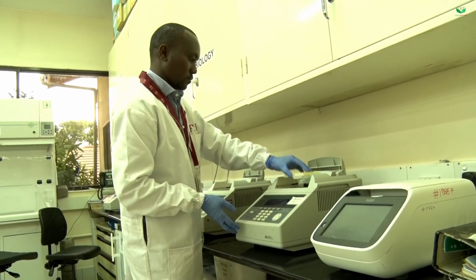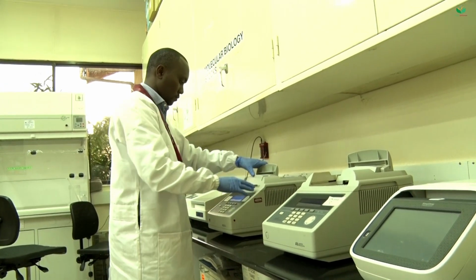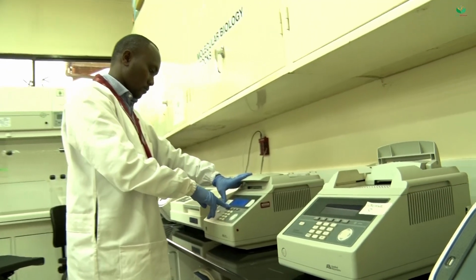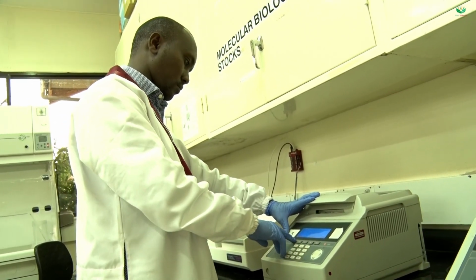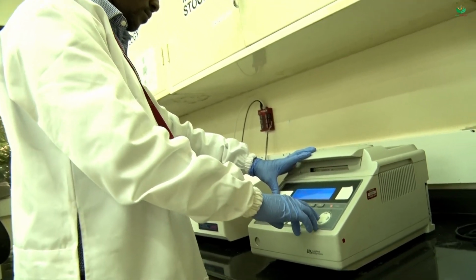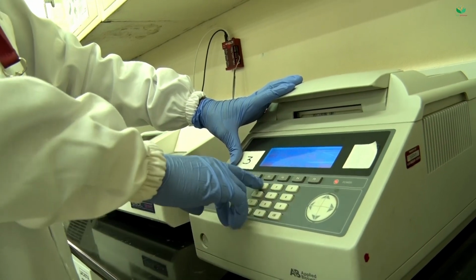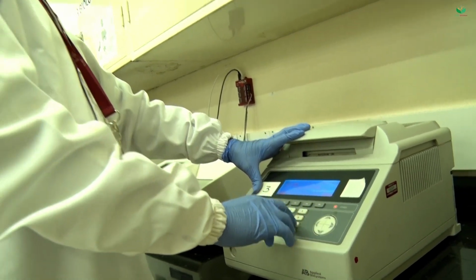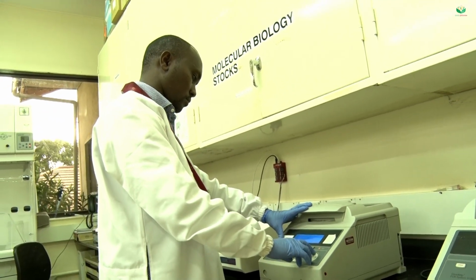There are, of course, previous approaches to generating live attenuated vaccines. One is the conventional genetic approach, but the challenge with the conventional system is it takes a longer time to generate a single candidate. It's estimated to be around 6 months conservatively, but with CRISPR, we have shown in our labs that we can reduce that time to less than 2 months. And by doing so, we're able to generate multiple vaccine candidates.